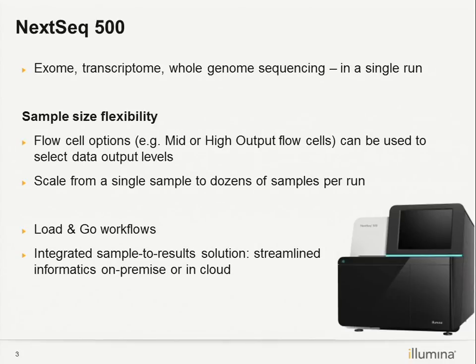So as you mentioned, we don't need to do the analysis on the cloud. You can either do it in the cloud or do it by yourself. As long as you have a Linux supported computer, you can install the software called bcl2fastq, which is free. You can download the software for free from our website, and then you can convert the base call files to the FastQ files.